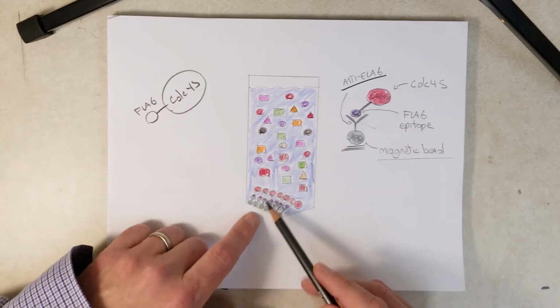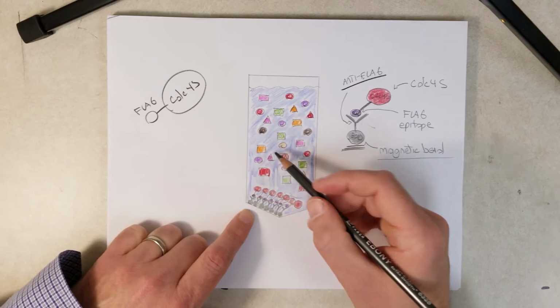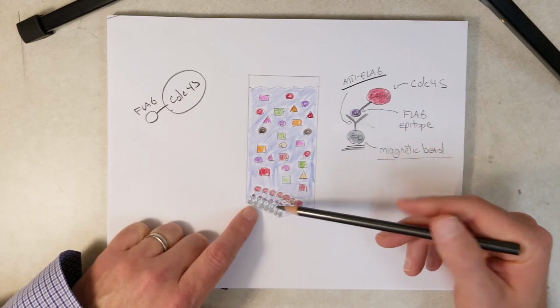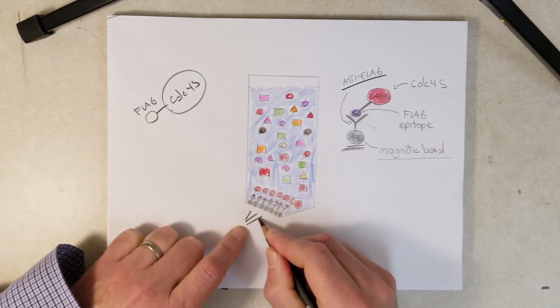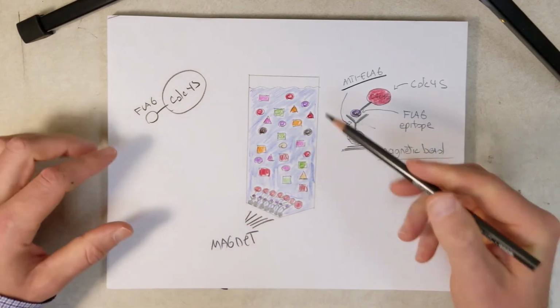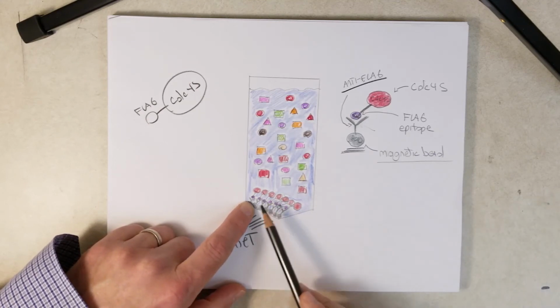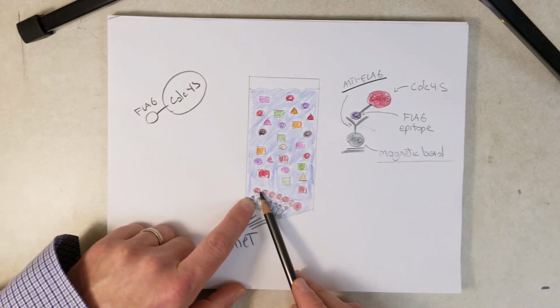So I have that diagram down here. Now, this is our solution of our total protein. We've added the magnetic beads. And what we're going to do is hold a little magnet down here. All the magnetic beads are going to be stuck at the bottom here, and they're all attached to the CDC45 flag fusion proteins down here.